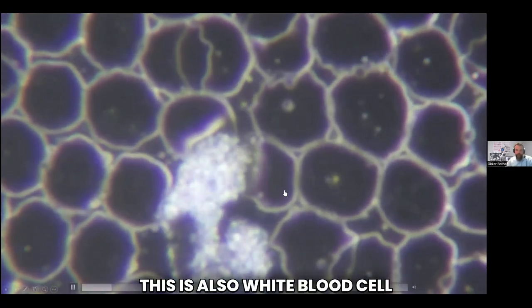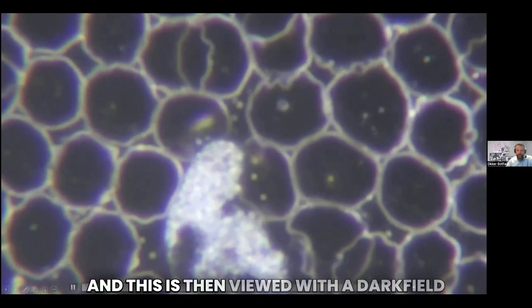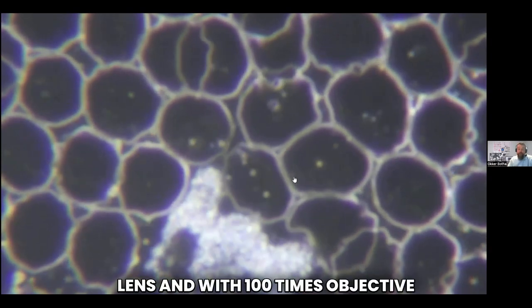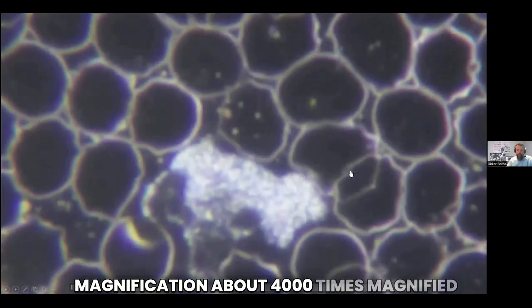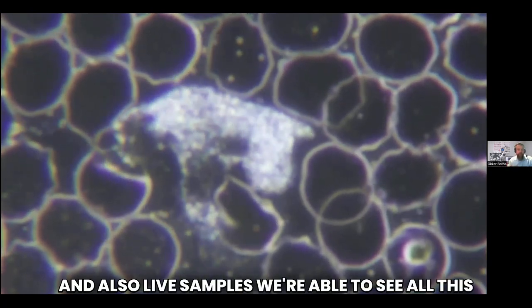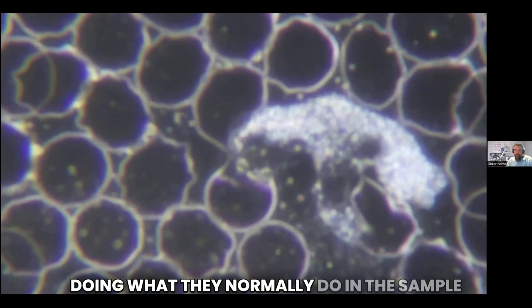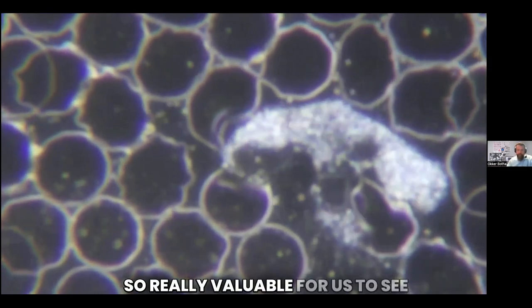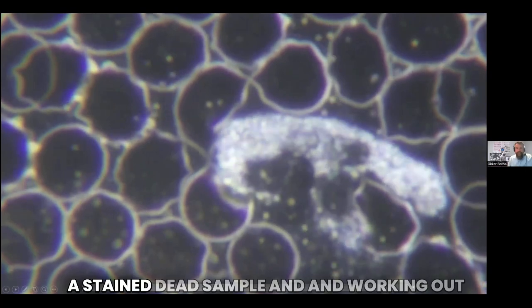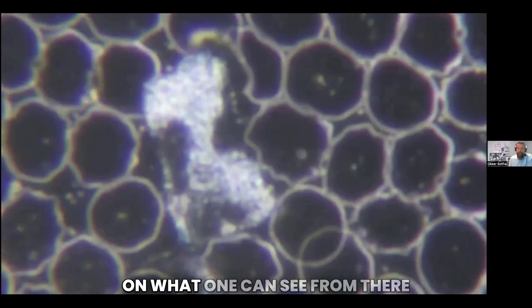This is also a white blood cell, the bright structure in the lower central area of the slide here. It's also a neutrophil, and this is viewed with a dark field lens and with a 100 times objective, so a very high level of magnification, about 4,000 times magnified, and also live samples. So we're able to see all this activity taking place, all these changes, the cells behaving and doing what they normally do in the sample. So really valuable for us to see this, as opposed to looking at a stained dead sample and working out dynamics of health and disease just based on what one can see from there.